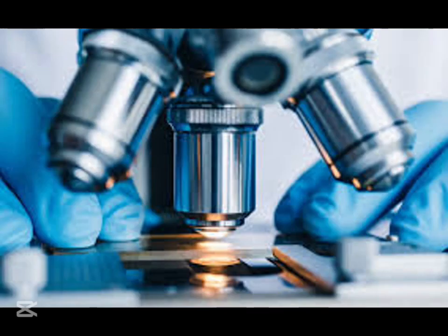Cool. So if we can see things 40 times bigger, what kind of crazy stuff can we actually see under a microscope? Oh, get ready to be amazed. We can see a whole hidden universe. Have you ever looked at a leaf up close? Well, yeah, but not under a microscope. Under a microscope, a leaf is a whole different world. You can see the tiny pores it uses to breathe. They're called stomata. They look like tiny mouths opening and closing. You can even see the veins that transport water and nutrients throughout the leaf, like a miniature highway system.